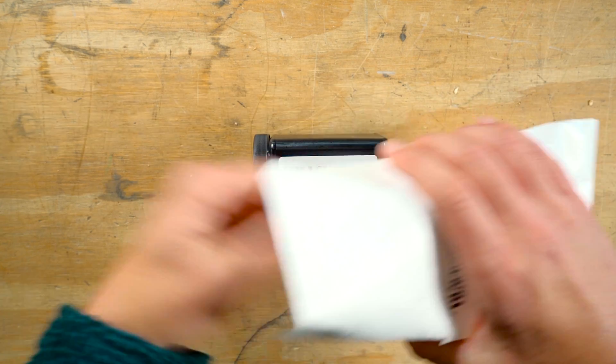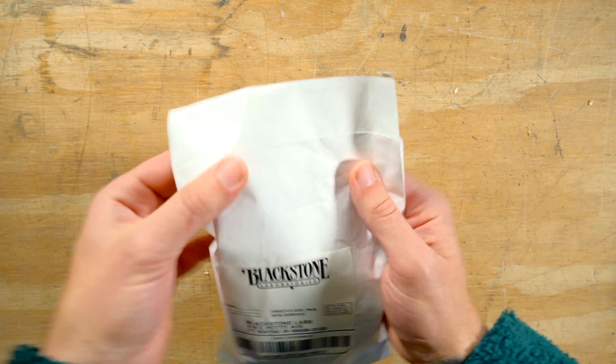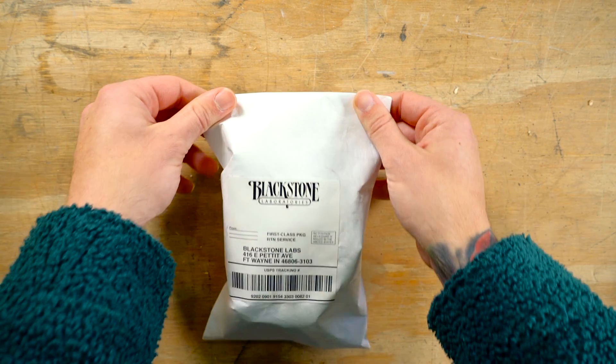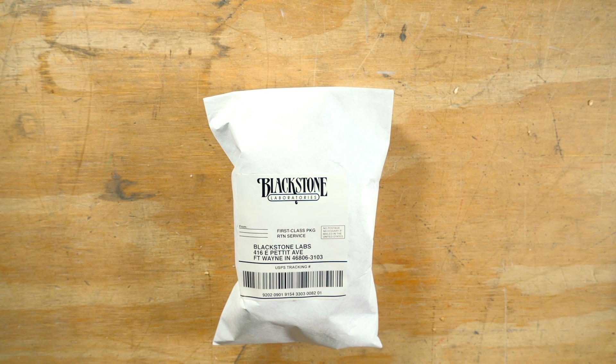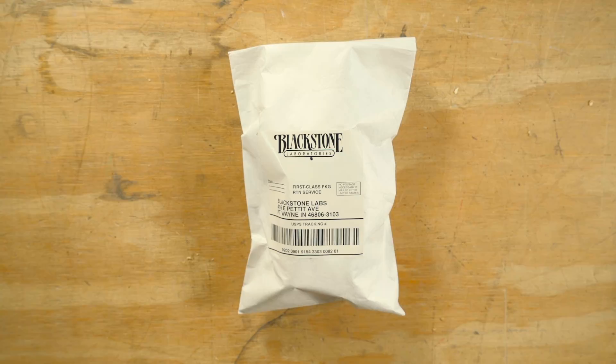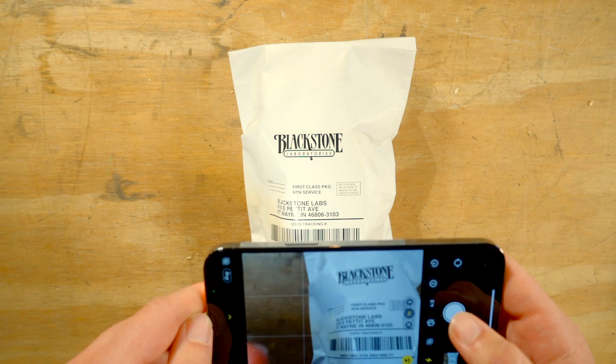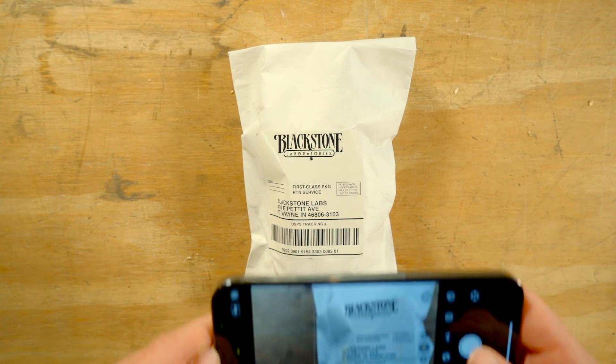Once the bag is in the black container, just drop it in the envelope and seal. No additional tape needed. Before sending it, make note of the tracking number on the shipping label to reference so you can check for updates and when to expect your sample's arrival. And if your chicken scratch is anything like mine, taking a picture works best.